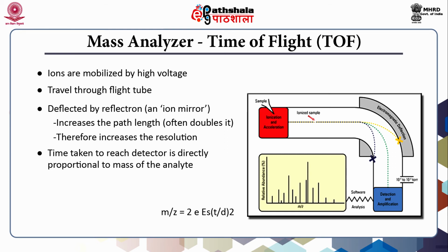TOF has been modified according to the type of required application. TOF in triple quadrupole is good for amino acid sequencing. MALDI QTOF is good for amino acid sequencing as well as molecular weight determination. QTOF is good for amino acid sequencing and any protein modifications.